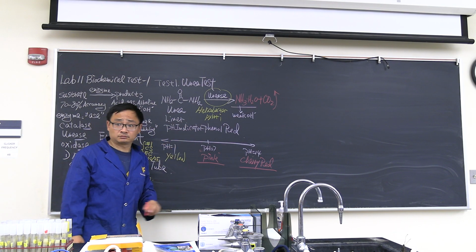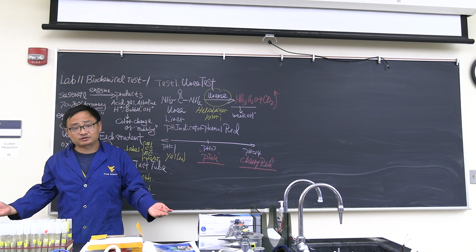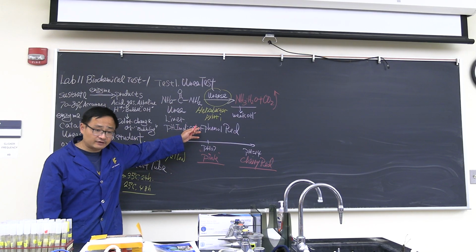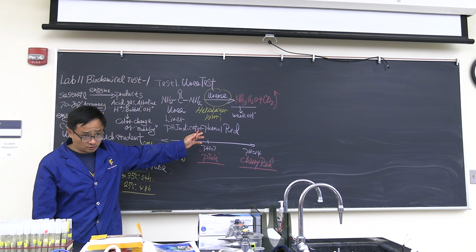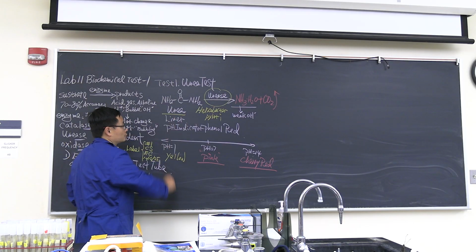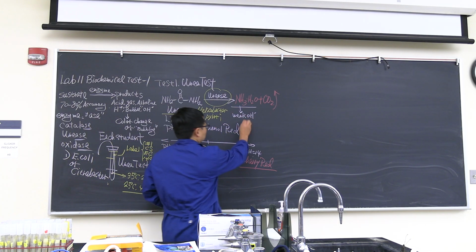Now why? We learned in the lecture, stomach is very acid. The acid environment is pH 1 to 2. But why can this bacteria survive? I tell you, not only survive, it can grow and possibly cause stomach cancer. The reason is this bacteria has urease. They can break down urea, become ammonia. This is a weak alkaline.